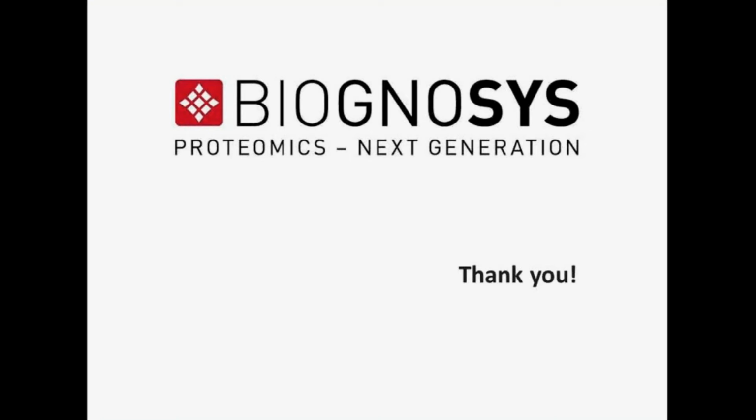All right, very good. I think that's important to let people know exactly how many microtissues are required. I think that's a very powerful tool for just 12,000 cells to be able to get that detailed proteomic analysis out of it, and that speaks to the sensitivity of your technology and also the metabolic robustness of the microtissues as well. So, two very powerful technologies combining to give people, like you said, unbiased mechanistic information out of a small amount of tissue.